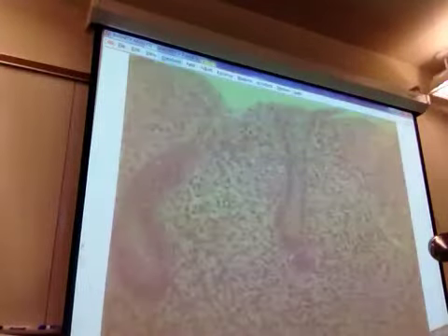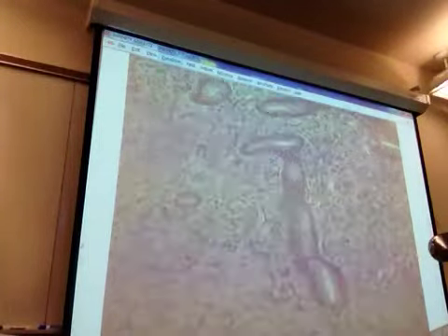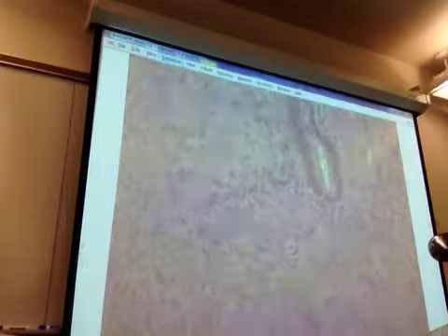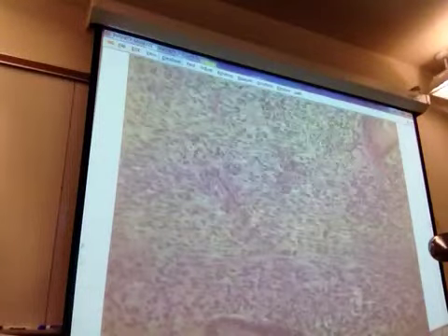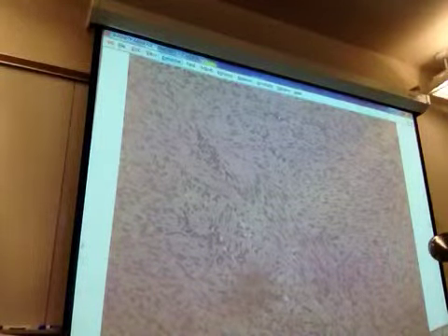It would be lamina propria in there, but then too, remember that the uterine lining gets thicker. Wait, there's smooth muscle though, right? We go back down a little bit. Well, remember the basilar zone is going to stain a little bit different too. But that is smooth muscle, so that's part of the myometrium. Good? Okay, good. If I show you a layer, it's going to be a definite, like, hey, that's smooth muscle, or hey, that's epithelia, or hey, there's glands there, therefore it must be this layer, okay?